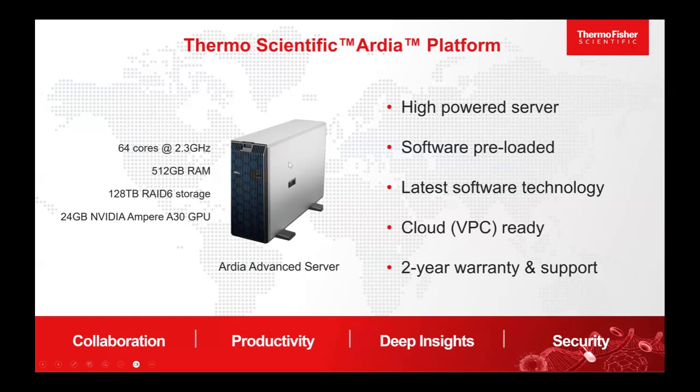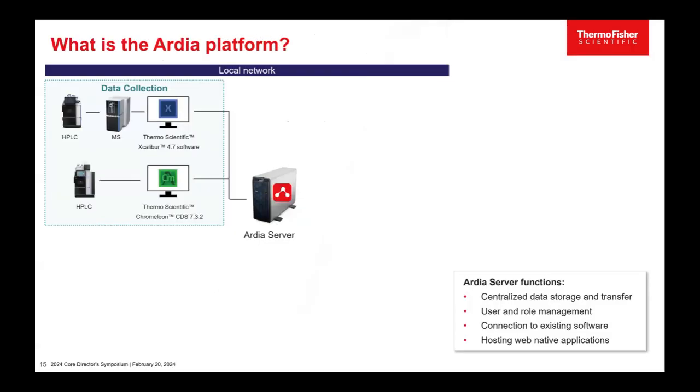The version of Chimerys that pretty much everybody's using right now is on the cloud. And so most people have been sending their data up to the cloud, running the data on the cloud. Chimerys needs a very specific type of computing setup for the deep learning. And so it's either on the cloud right now or this local server version, which is much faster, more powerful, can run more Chimerys runs at a time. You can also see it has 128 terabyte RAID storage. The effective storage is more like 80 to 90 terabytes of data. And I'll show where it fits into the lab.